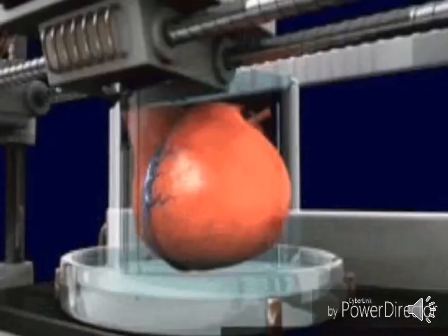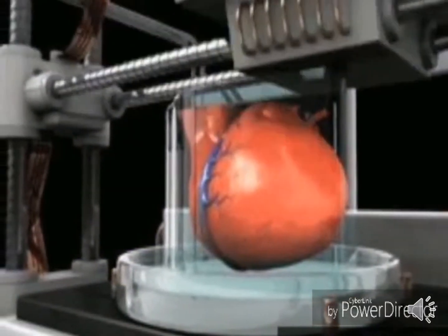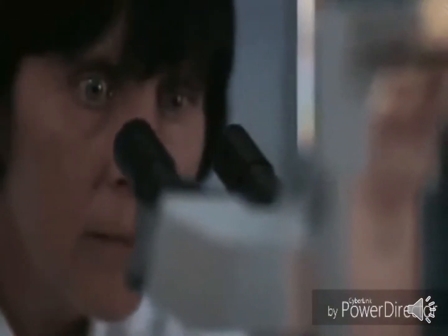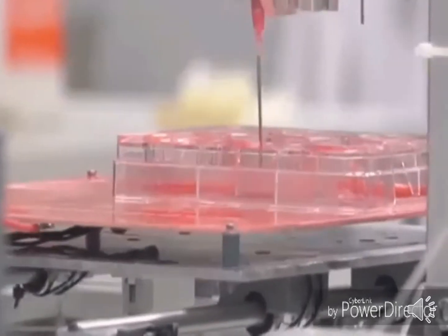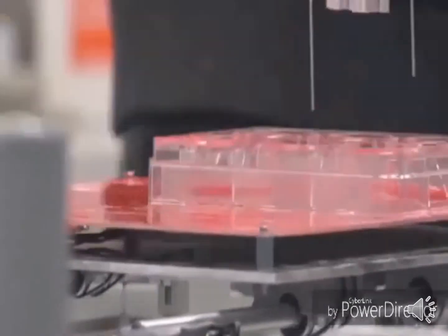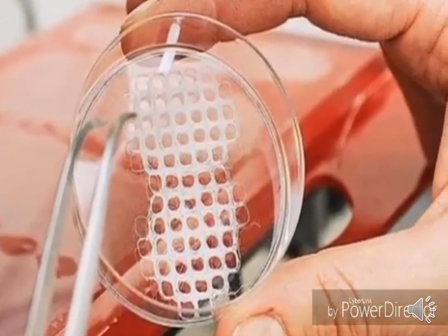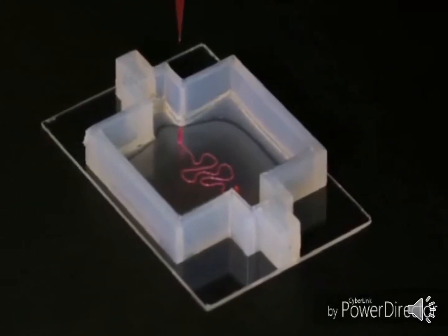By 1999, Wake Forest Institute of Regenerative Medicine used a 3D printer to build a synthetic scaffold of a human bladder. And in 2003, Thomas Boland was able to modify an inkjet printer so it can accommodate and dispense cells and scaffolds. Also, the first bioprinting lab was opened, where bioprinting was practiced regularly. A year later, a technology that can engineer tissues with only cells was developed.